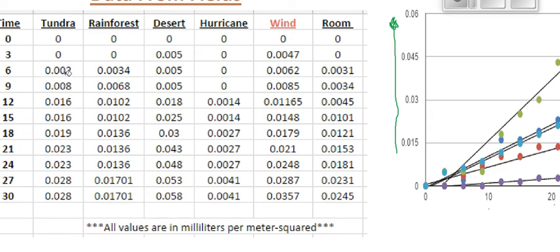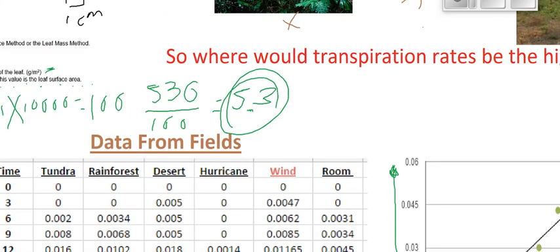The species of plant I used resulted in these very low transpiration rate numbers. The genus of plant that y'all used, this ivy family, should all have around the same numbers. So if we have a group that has very low values and then a group that has like 100s, one of the two is clearly wrong. Make sure that you are doing the math correctly. If you need help with that, think about how I ran this section right through there, and make sure that you've set it up the right way.